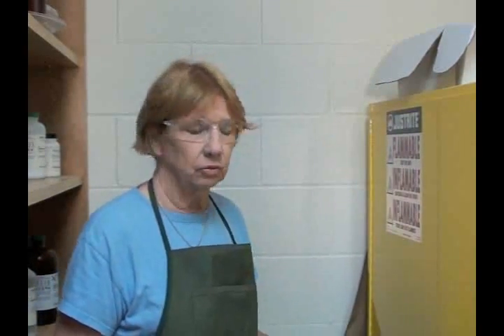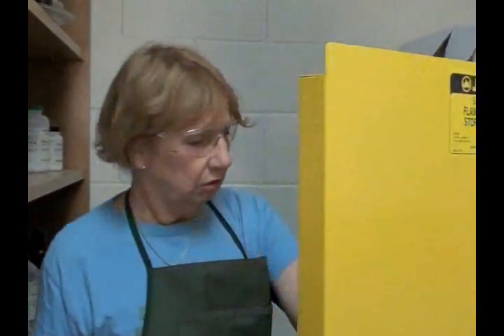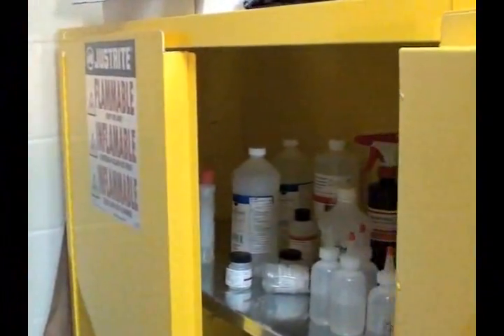The worst peroxide formers are ethyl ether and cyclohexene, not cyclohexane, but cyclohexene. And we've had several problems with those materials in high school storage areas. So be careful when you're going through the flammable cabinet. This is where you might need to use your mirror in case there's an old bottle that you aren't sure what it is, because you don't want to move or touch any of these bottles that are extremely old, because it is possible that they are peroxide formers.